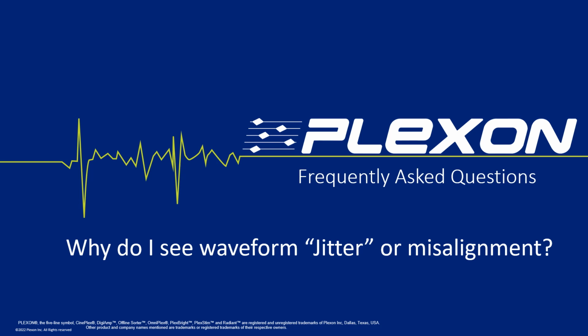Recently, a customer contacted us regarding waveform jitter or misalignment. This is a common question and concern we receive from Plexon users. Luckily, Offline Sorter has the functionality to closely visualize the data, which will help to understand this jitter or misalignment.